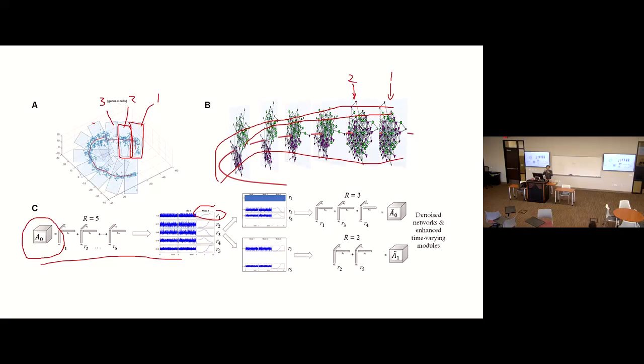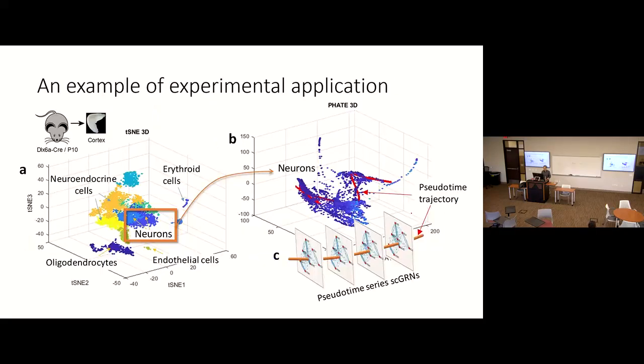It looks very messy, but if you follow some major meta signals, you may reconstruct some of these components through network change and try to learn from there. So that's some idea. We try to use information which can only be reconstructed from the pseudo time. If you don't have the pseudo time, you don't have this time trajectory variable to play with your data. So I think that's adding value to the study of single cell data.